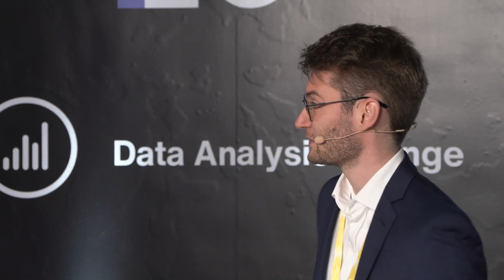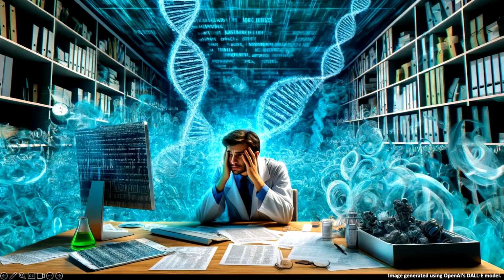Yeah, thank you, Sarah, for this very kind introduction, and it's a pleasure for me to be here today and present you some of our very recent research on enabling real-time analysis. So we've all heard it this morning, nanopore sequencing has revolutionized genomic sequencing, and we all love it. Yet, it brings new challenges. And one challenge is the massive data flood that many labs are actually facing. No longer is sequencing a bottleneck, but rather the analysis of the sequence data.